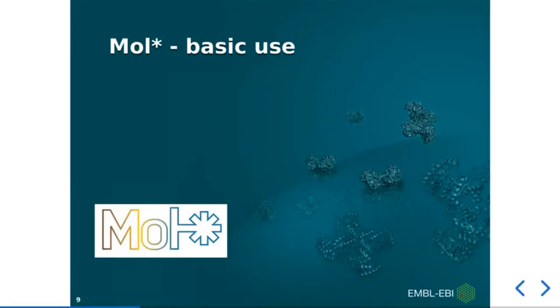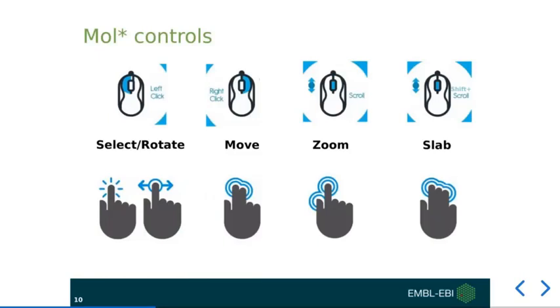Let's look at the basic usage of Molstar and show you how to load a structure directly from a PDBe entry page. But just before, let's briefly run through the controls. Depending on whether you're using a mouse or a touchscreen device, the controls are as follows.